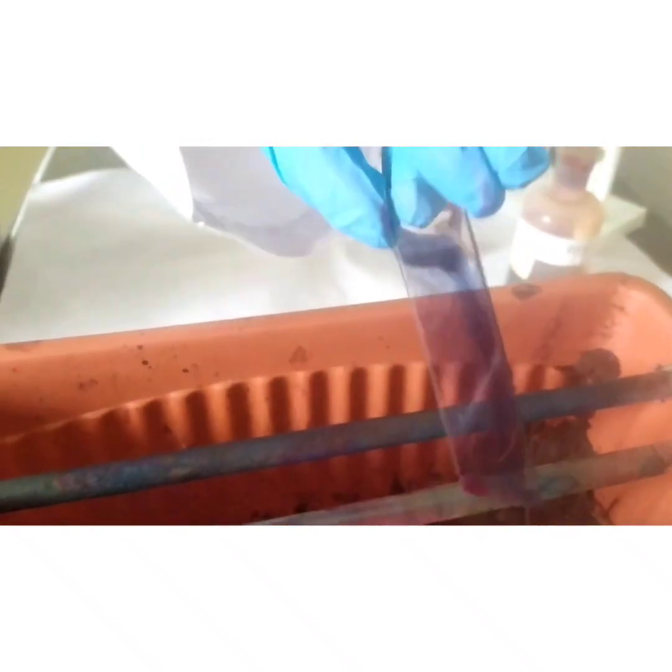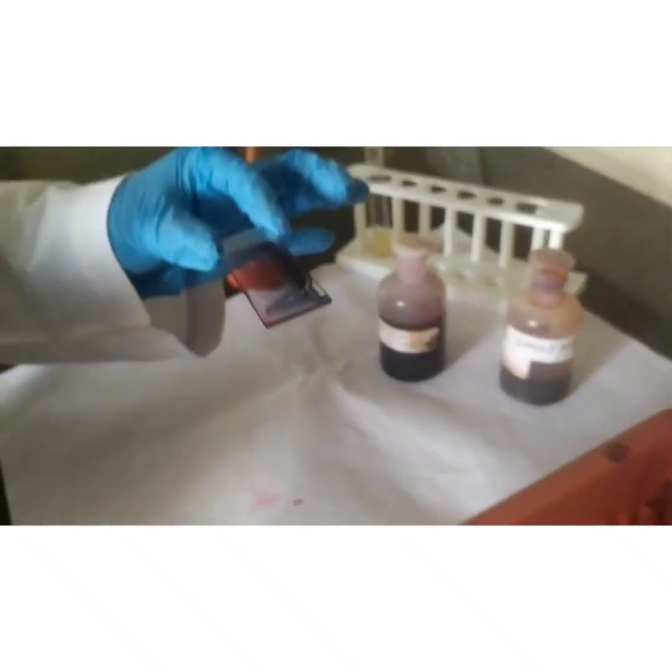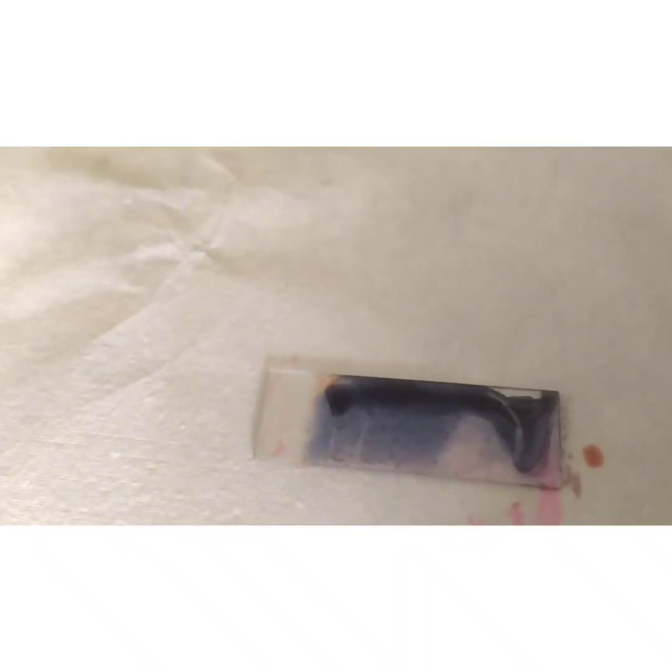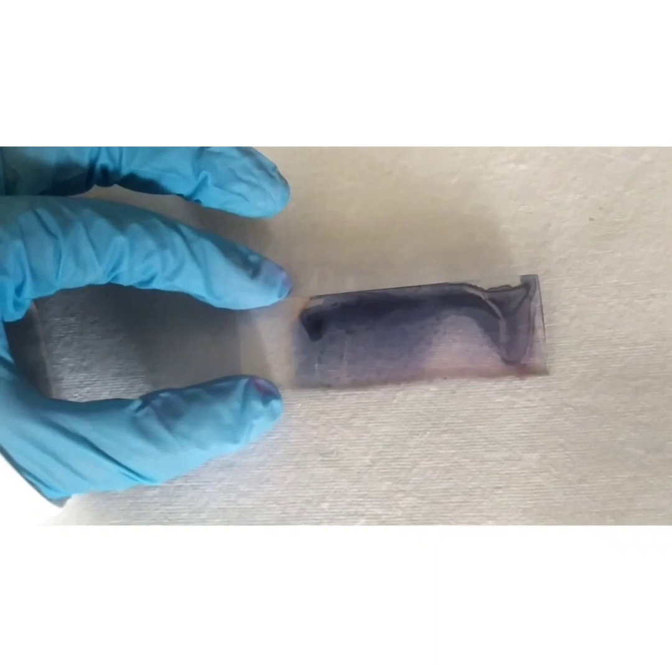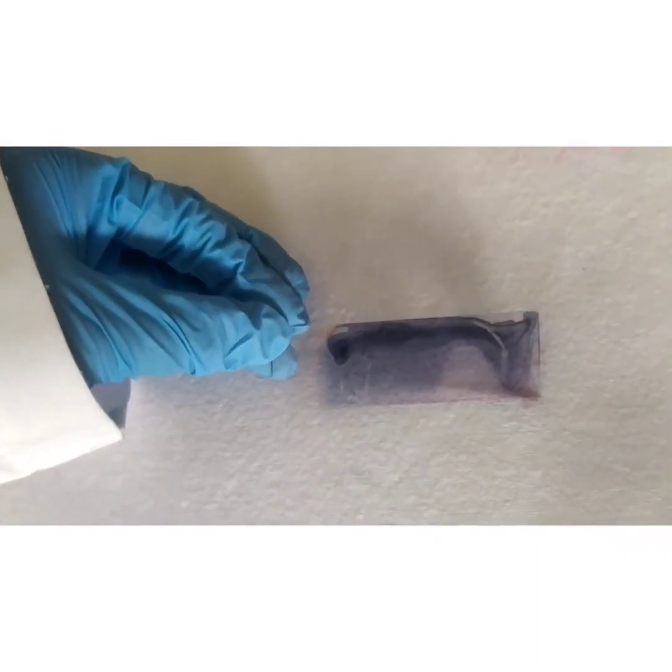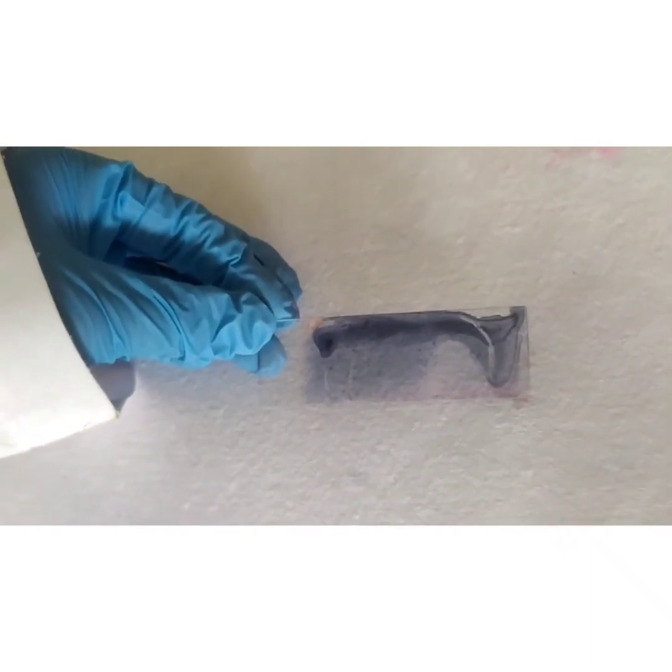Allow the smear to air dry. Once it is dried, now observe it under the oil immersion objective, where the cells will appear red, the capsule around it will appear colorless, and the entire background will appear blue.